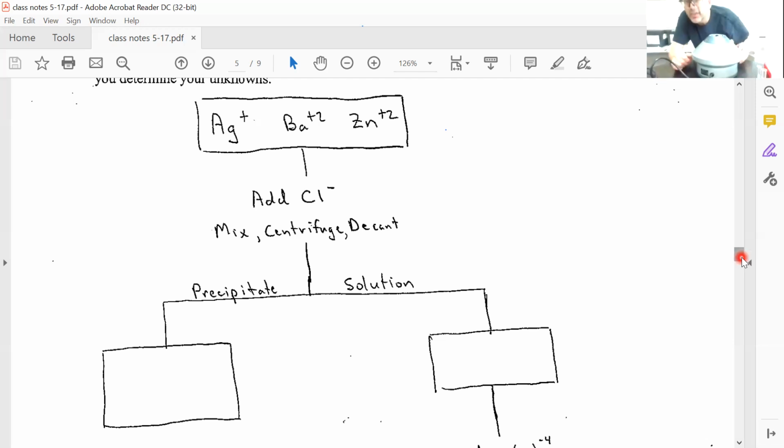So I have a centrifuge right here. And this is my silver chloride right here, and this is just a blank with water. The only reason I'm doing the blank is because I want to keep it balanced when I do this. Now, if somebody else had their unknown and it was labeled well, I could do that. I turn that on. This one doesn't have a hood. It's moving really, really fast.